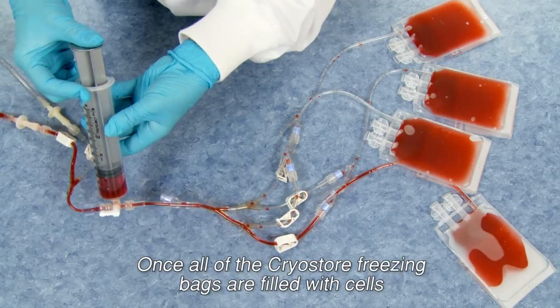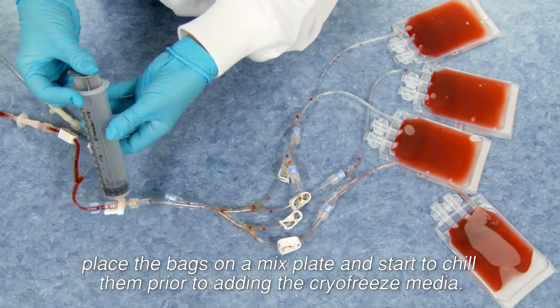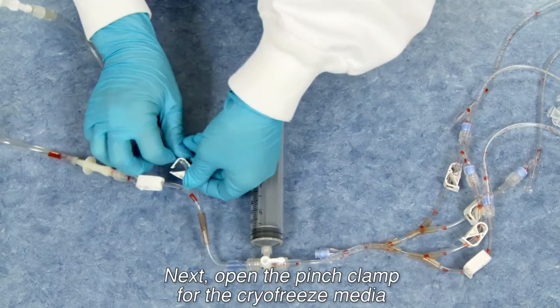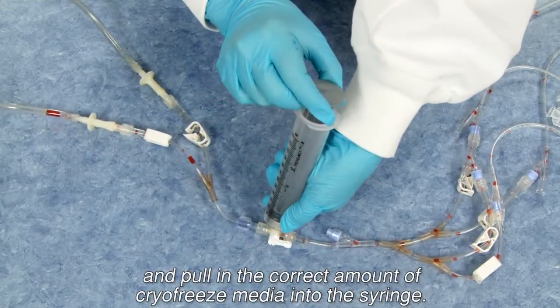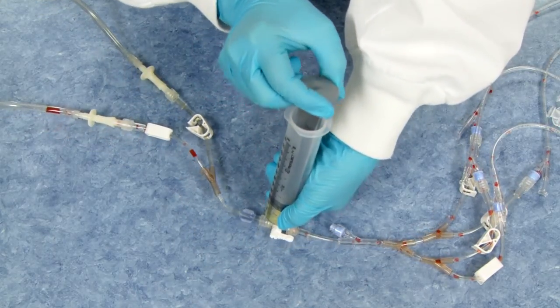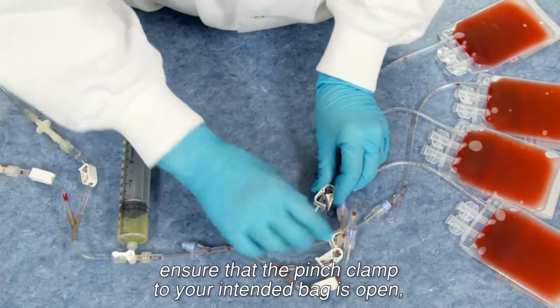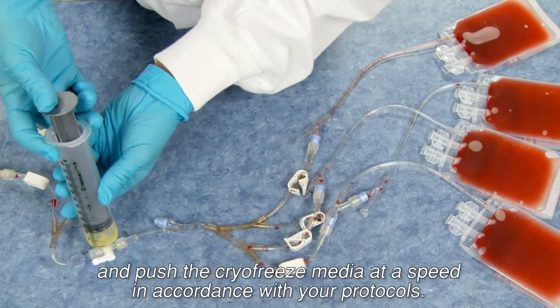Once all of the Cryostore freezing bags are filled with cells, place the bags on a mix plate and start to chill them prior to adding the CryoFreeze media. Next, open the pinch clamp for the CryoFreeze media and pull the correct amount of CryoFreeze media into the syringe. Adjust the stopcock, ensure that the pinch clamp to your intended bag is open, and push the CryoFreeze media at a speed in accordance with your protocols.